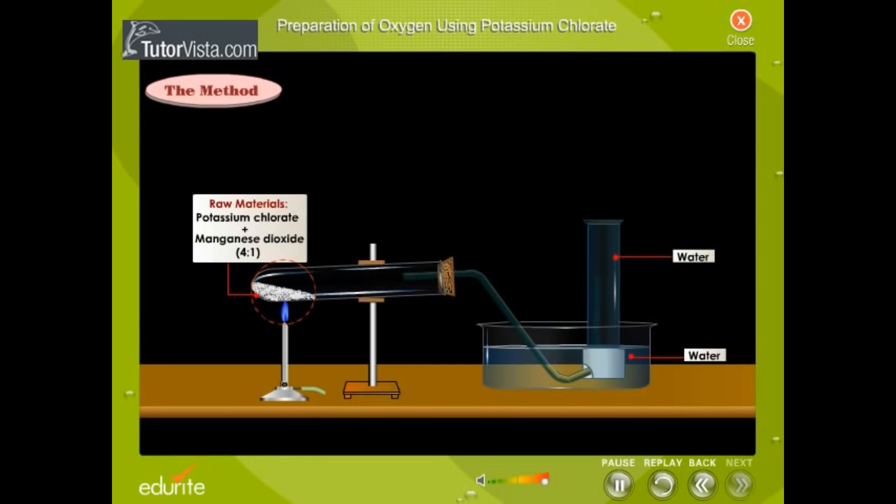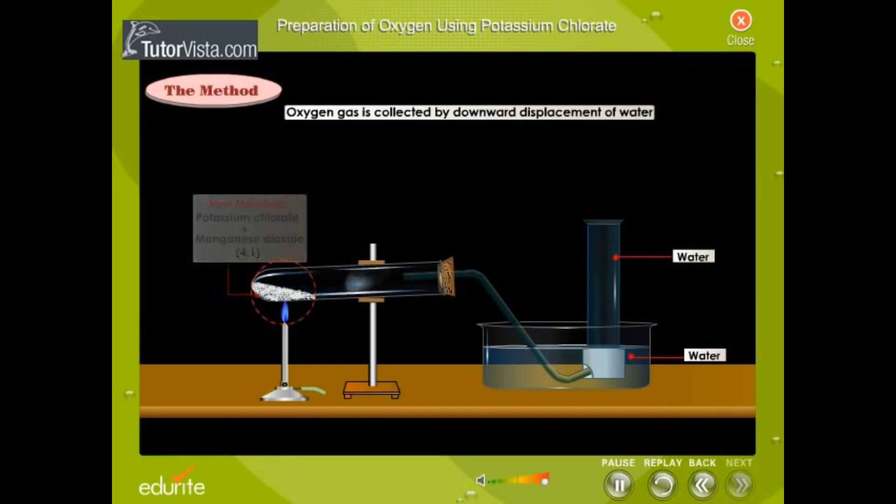Oxygen gas is liberated. Oxygen gas is collected in the gas jar by the downward displacement of water.